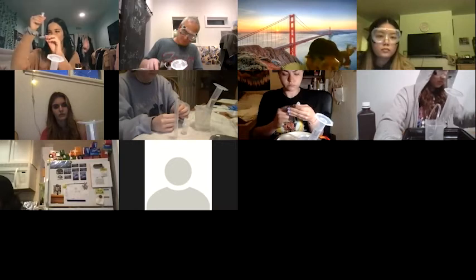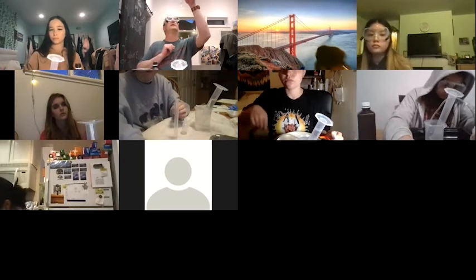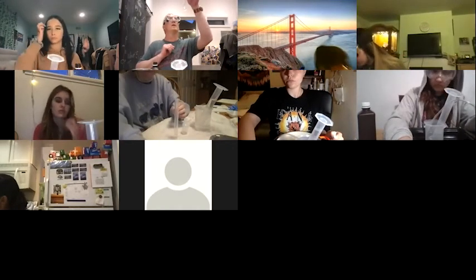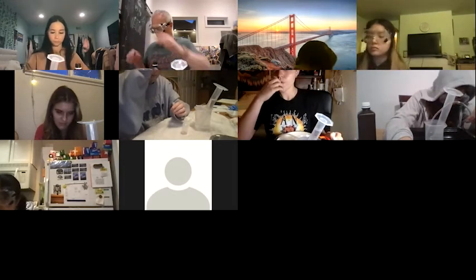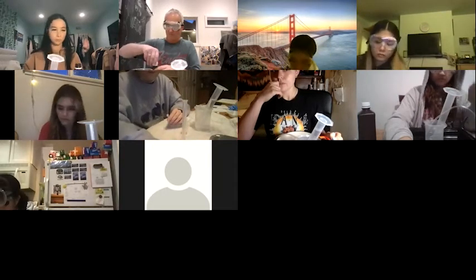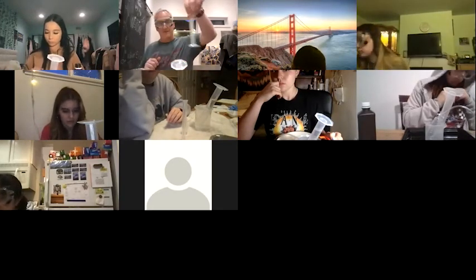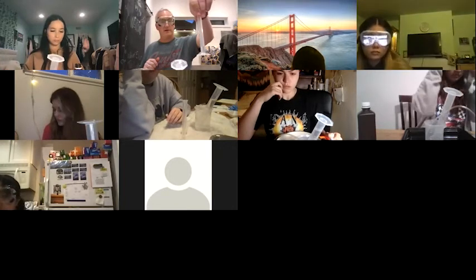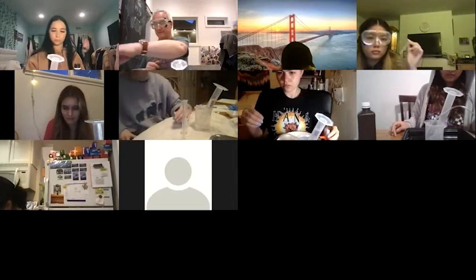There we go. So I have got 1.85 mils. So I went over 1. Remember, it's really important when you're measuring that this volume needs to be accurate. The volume of your hydrogen peroxide needs to be accurate, and the volume of the gas needs to be accurate. So both those things need to be as accurate as possible.